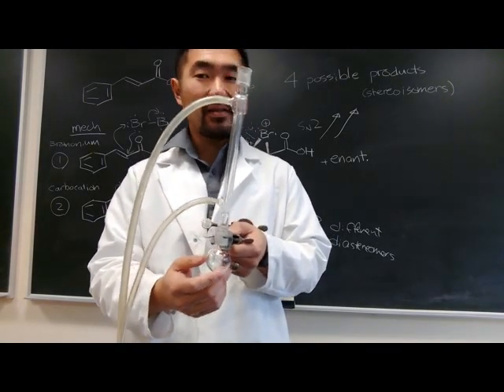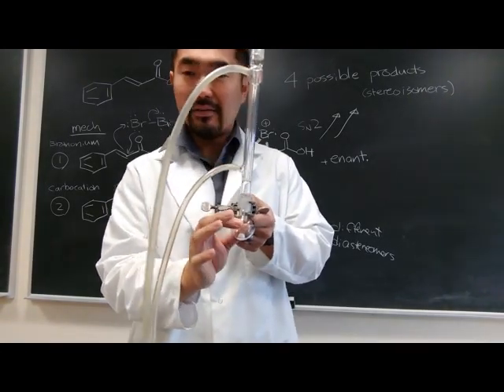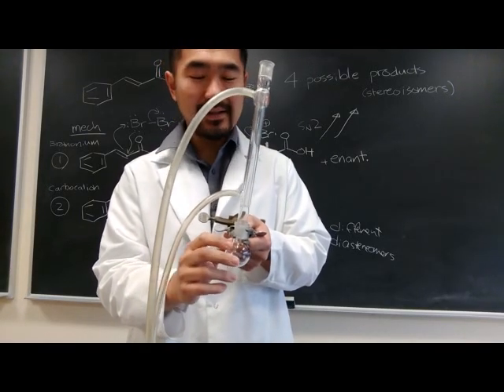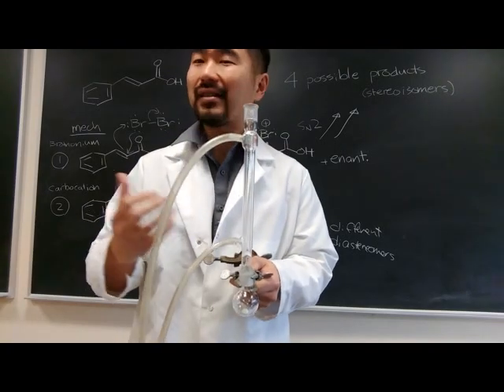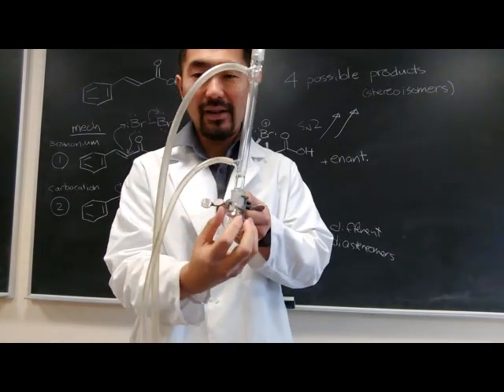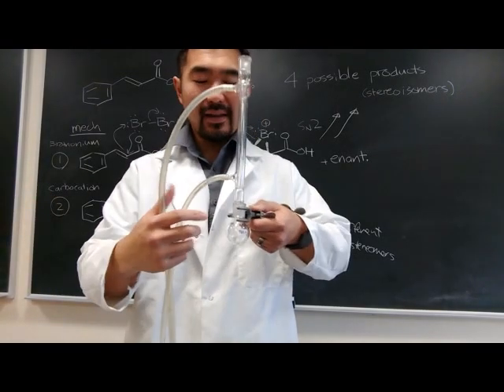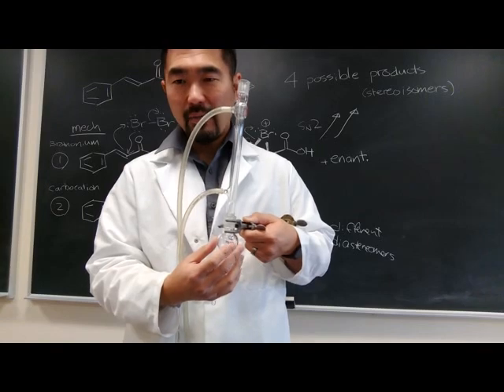So let's say the boiling point, which I'll let you look up, of the dichloromethane solvent is 50 degrees, which it's not, but let's say it is, then maybe your water bath could only be about 60 degrees, and that will actually bring dichloromethane to boil, because the hot water bath's temperature is at least a little bit above the boiling point of the solvent.